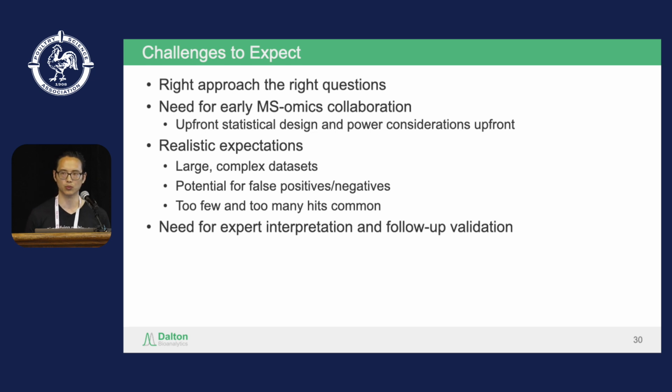Finally, when we end up getting the results and giving them back to our collaborators or customers, you can expect these things: it's going to be very large and very complex. It's going to be pretty difficult to analyze, and it's going to require both bioinformatic and domain expertise to really understand what's happening, right? Neither group alone is going to have enough expertise to cover all the ground that's in the results.